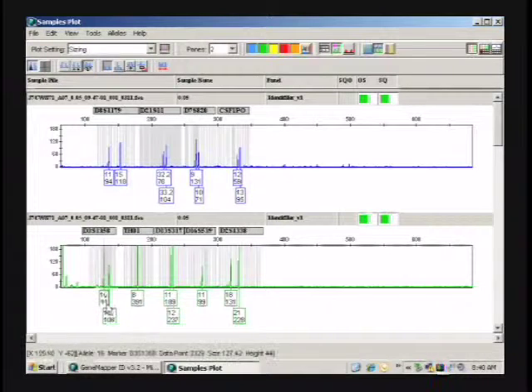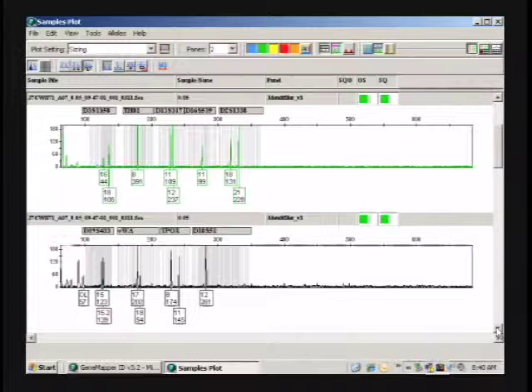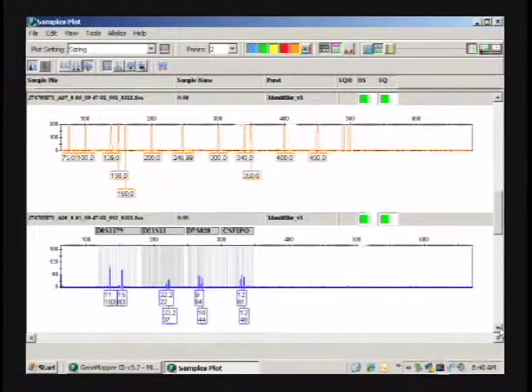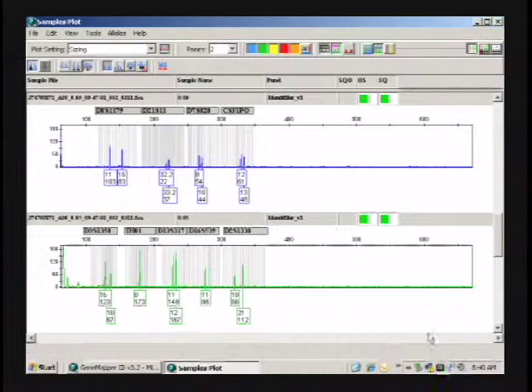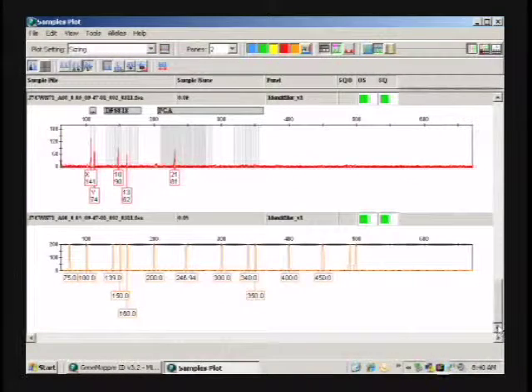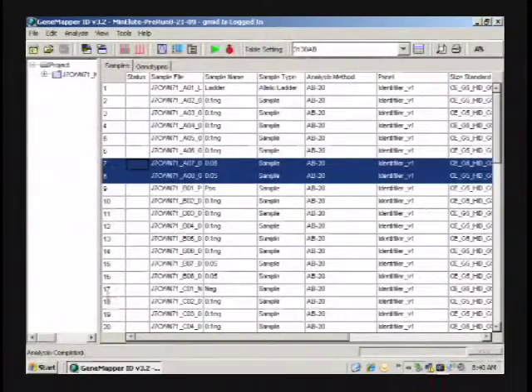We're going on to 94, 44. You'll also start to see some that are practically just about dropping out. That's pretty low there. So the peak height ratio is obviously way off on the 0.05 ones. The 0.05 is when I started to see a lot more stochastic effects occurring.